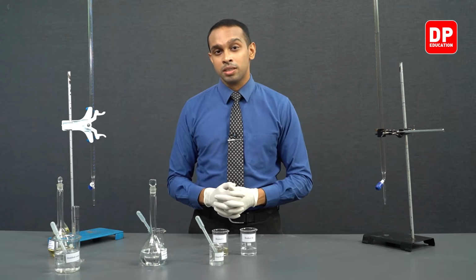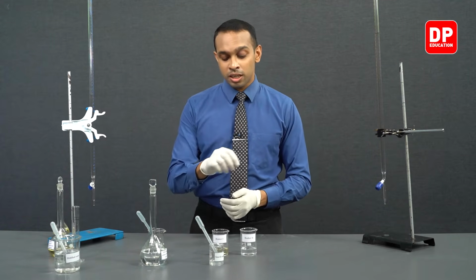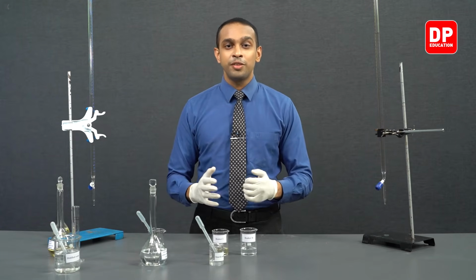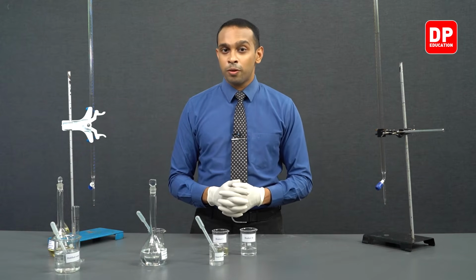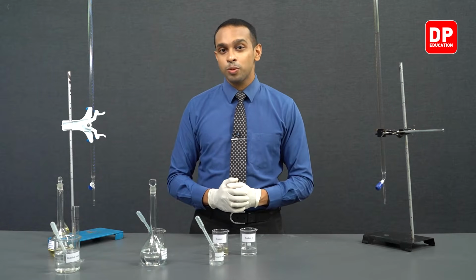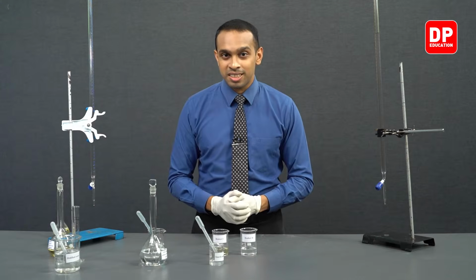If you have a magnetic stirrer with you, you will be able to use it. However, if you don't have one, stirring the solution will aid proper mixing of the reagents. It will result in obtaining a more accurate time for the color change to take place. So now students, let's move on to the part where we will be mixing these 2 on a magnetic stirrer.